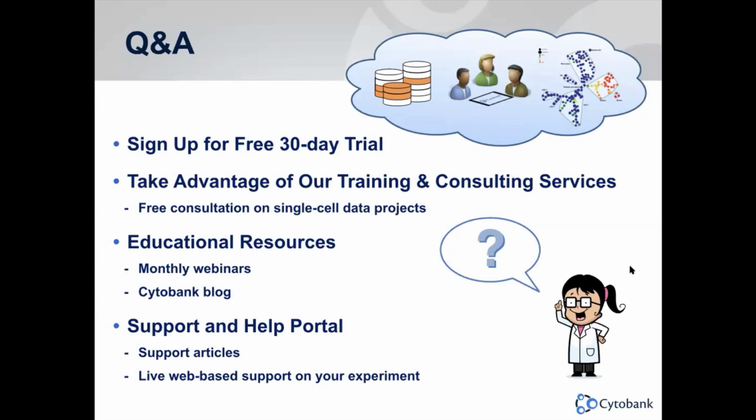So we would always do some alternative tool, and we use FlowSOM a lot, for example, and we used to use SPADE more before, and then we basically want to verify that the same population can be either gated manually or clustered by other methods, and we can actually find the cells to be sure that we're actually seeing something real.